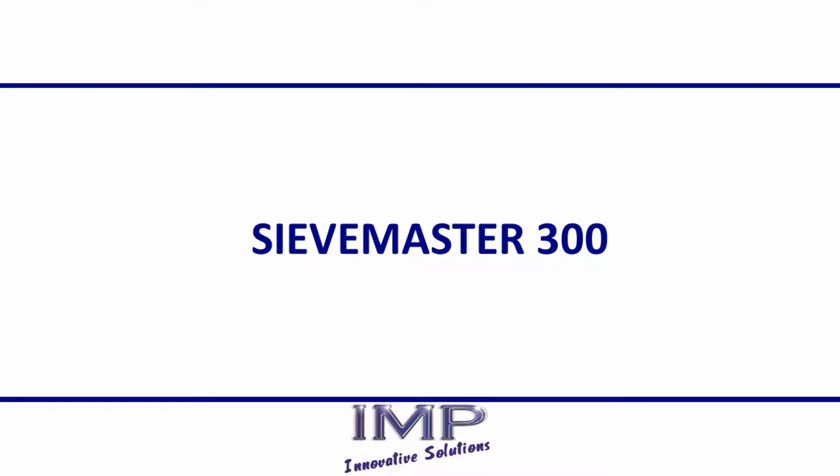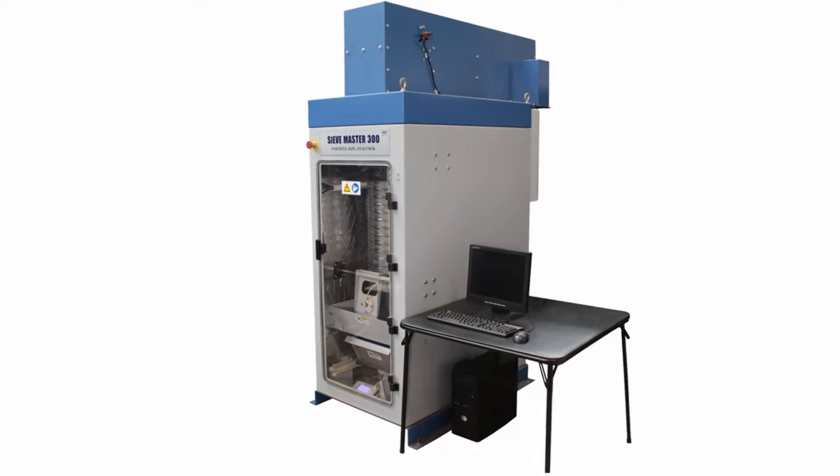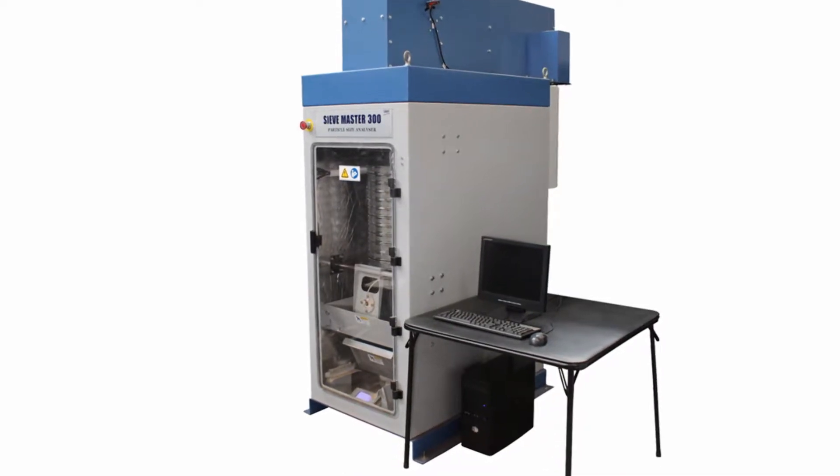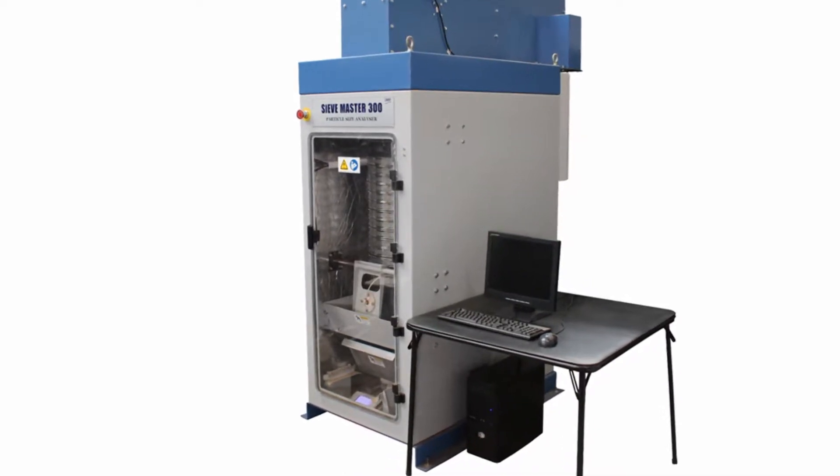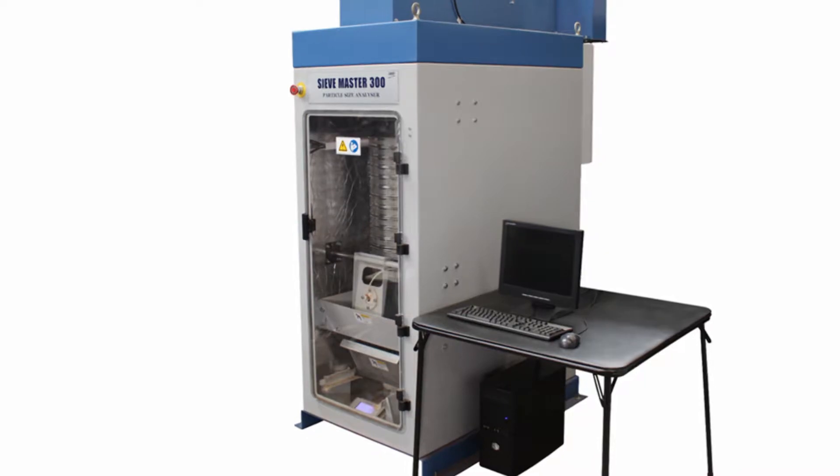IMP presents the SieveMaster 300. The SieveMaster 300 is an economical automated solution to sample particle size analysis.